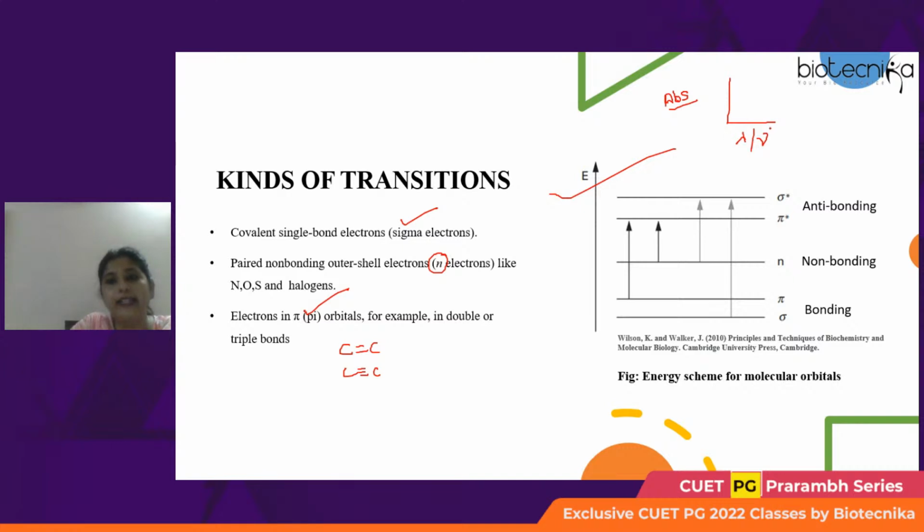Okay, so spectra means it's a graph where on one axis you have the absorption or emission, and on another axis wavelength or frequency. So you can measure at what wavelength how much absorbance is taking place. And every macromolecule that you are studying, like DNA or protein, absorbs at a particular wavelength, right? And we get the result in the form of a peak. In modern spectrophotometers, they plot the data for us in the form of a peak, where the height of the peak is proportional to the concentration. The larger the peak, the more the concentration, right?